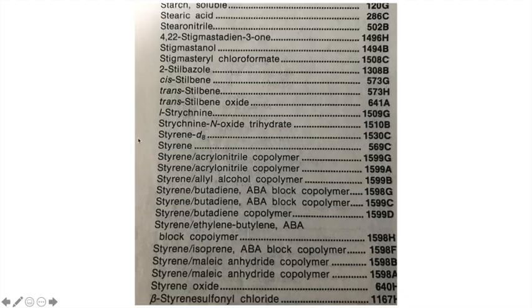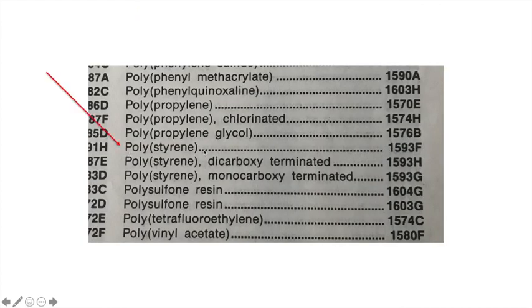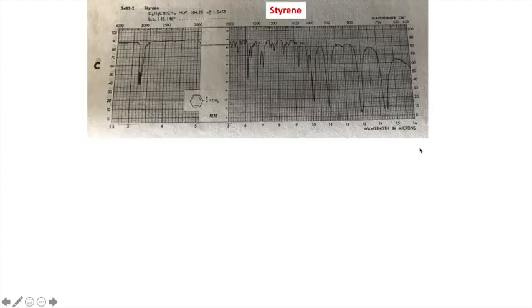So I went over to my book and looked up styrene first, and then I thought, wait, no, this is polystyrene. But then I thought, hey, well, let's look at that too. So styrene is at page 569, and it's the C spectrum. Then I went over and found polystyrene, that's at 1,593 F. So let's look at those.